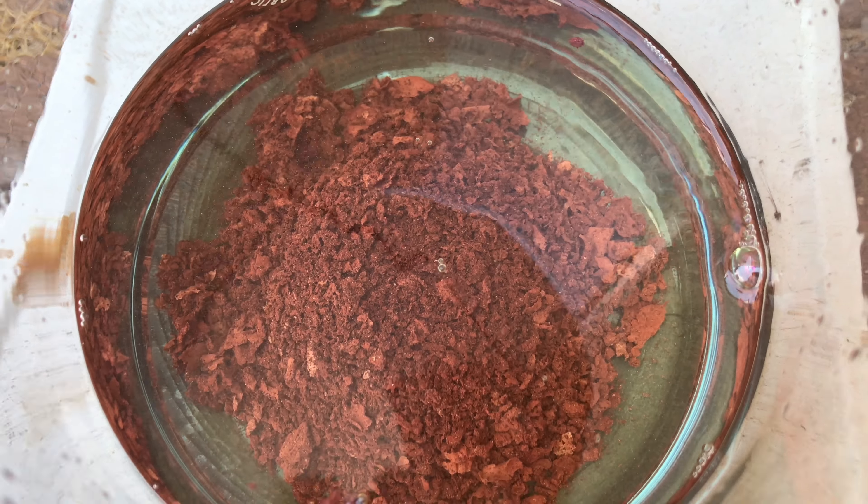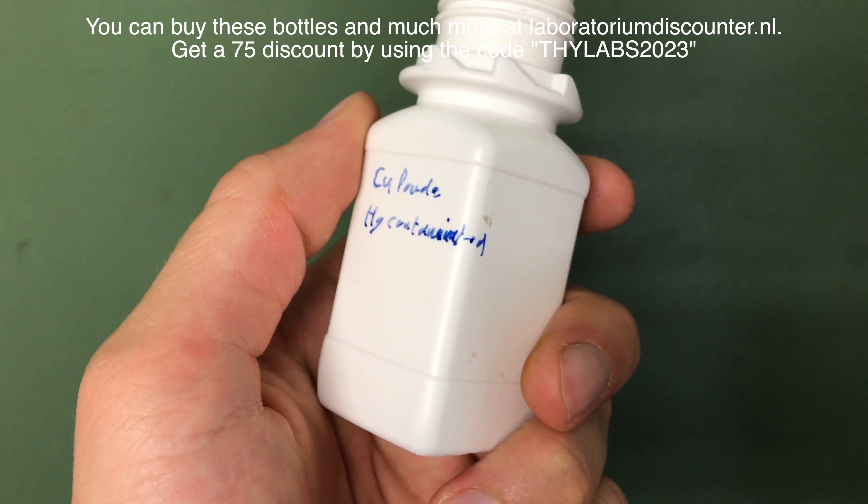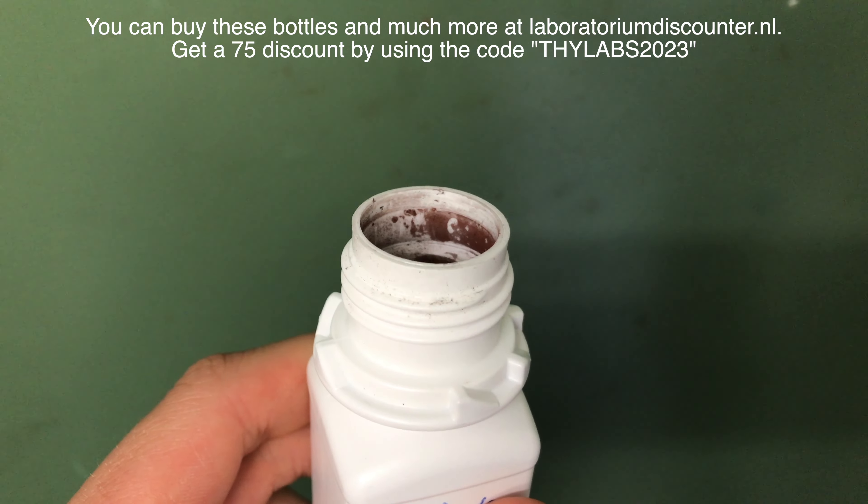And there you go — here you have elemental copper, which is fine enough for my purposes. It was filtered off and rinsed two times with isopropanol before drying it and packing it into a storage bottle.